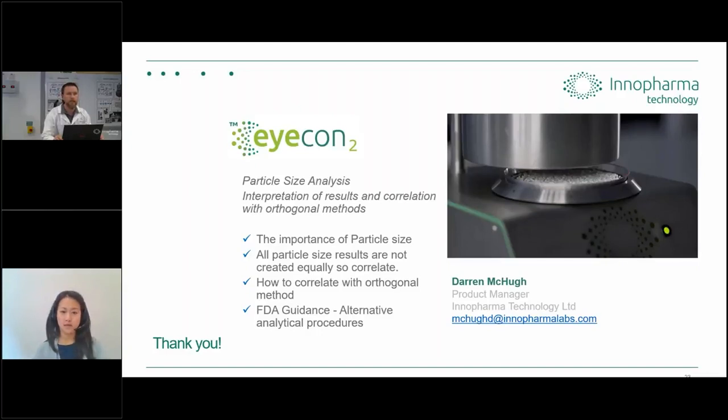The accuracy of the particles, we have a spec sheet for that. With the verification standard kits that I mentioned, we supply sizes from 50 microns to 5,500 microns, and they all have their own tolerances because that's the way they're manufactured. We're able to measure within those specified tolerances. So maybe for 50 microns, we could be talking plus or minus 10 micron accuracy, and that gets a little bit larger as you go up. But if the person that asked that question is interested, I can send that sheet over with that full range of accuracy for all those sizes.